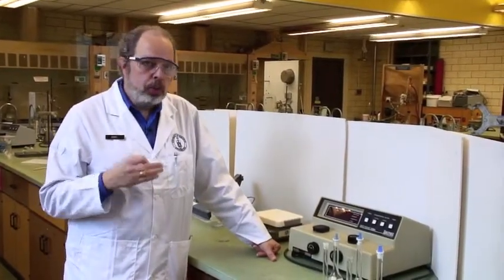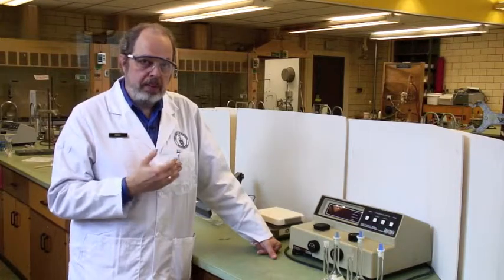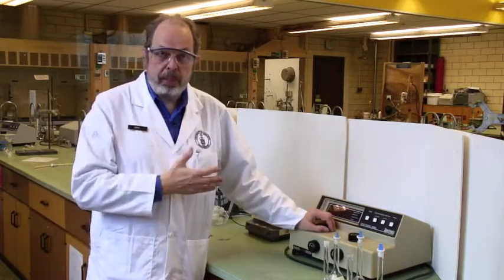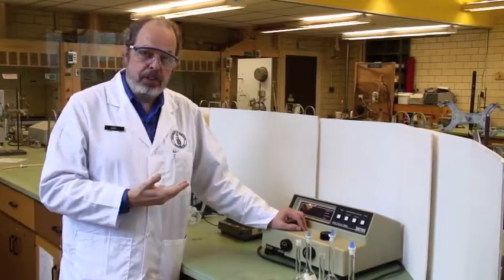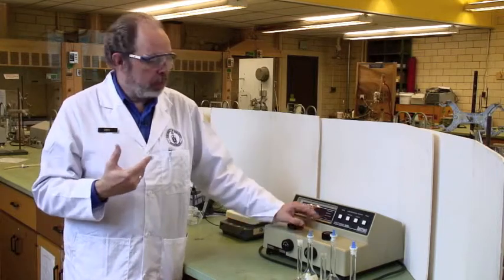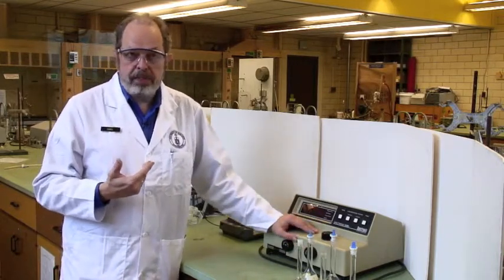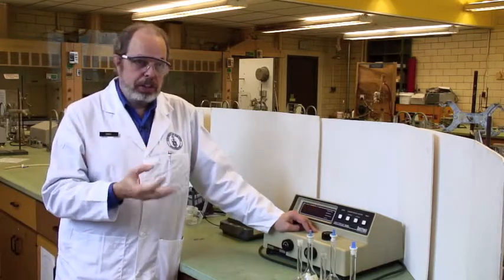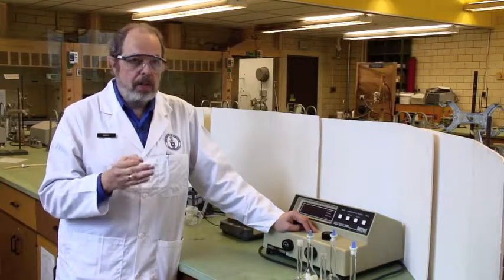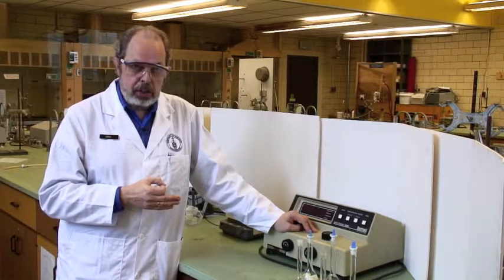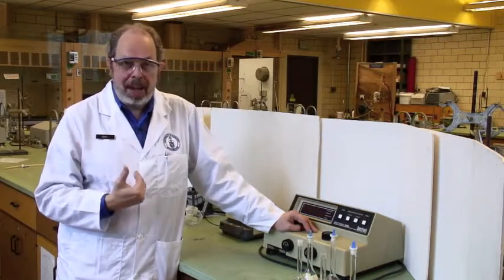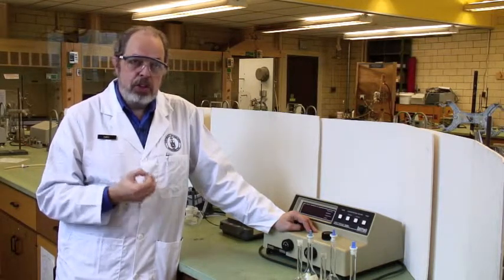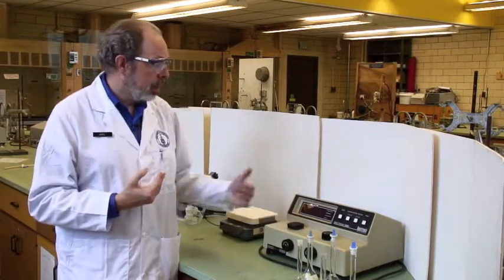Once you have got those spectra, you will choose the wavelengths that you will be investigating all five solutions at. And you take your Spec 20, set the wavelength to wavelength 1, and read all five solutions at the first wavelength. Then the second wavelength, reset the machine to the second wavelength, and read all five solutions at that wavelength as well. That will help you with the concentrations of color number 1 and color number 2. The only thing that's missing from the equilibrium constant expression at this point is pH, because this is an acid dissociation. So the concentration of H plus is very much in the mix. To measure that, you're going to need to use a pH meter, and that's what's behind me here.